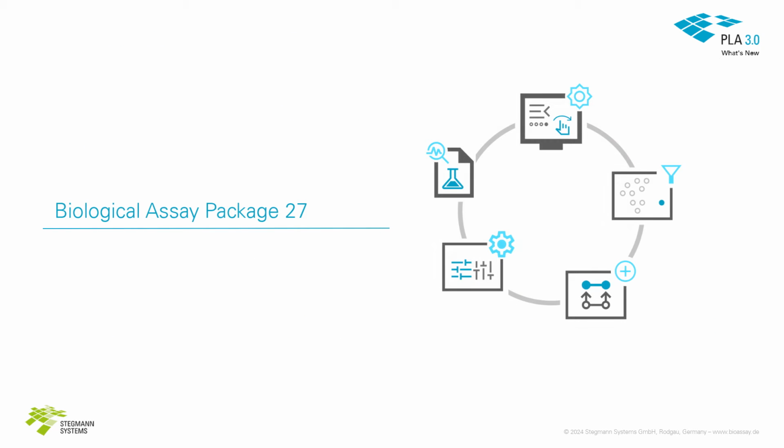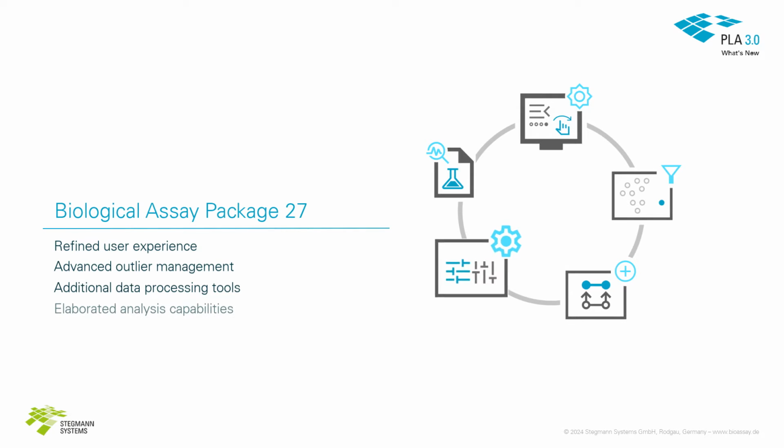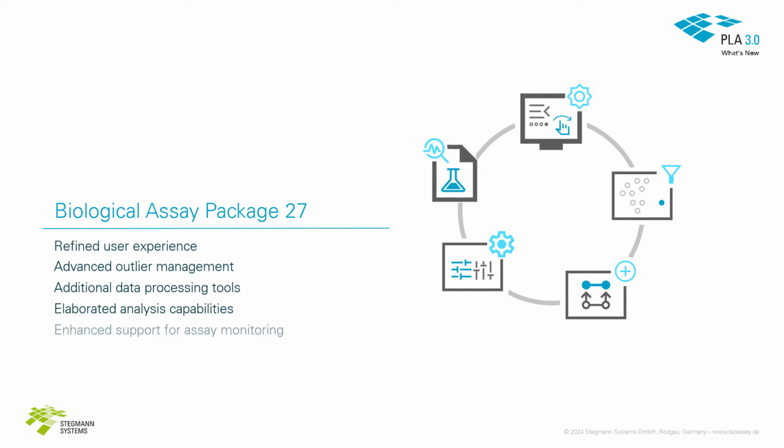The key features of the newest version are a refined user experience, advanced outlier management, additional data processing tools, elaborated analysis capabilities, and enhanced support for assay monitoring. Before we step into the details of the new features, let's have a look at the PLA 3.0 update strategy.